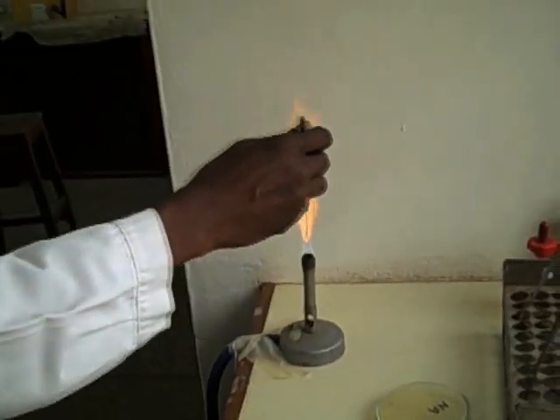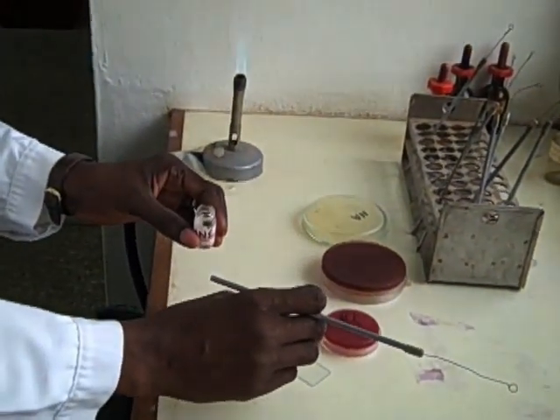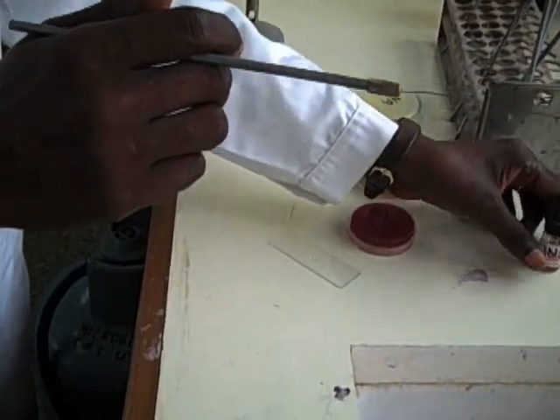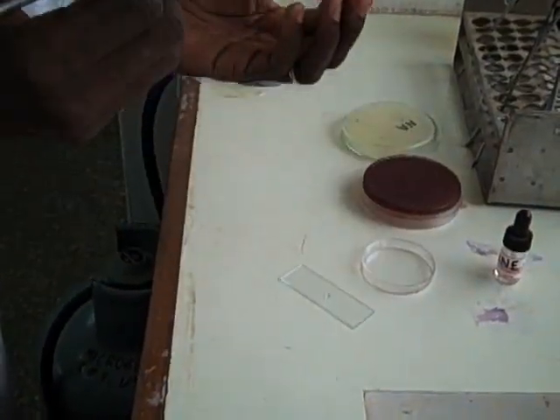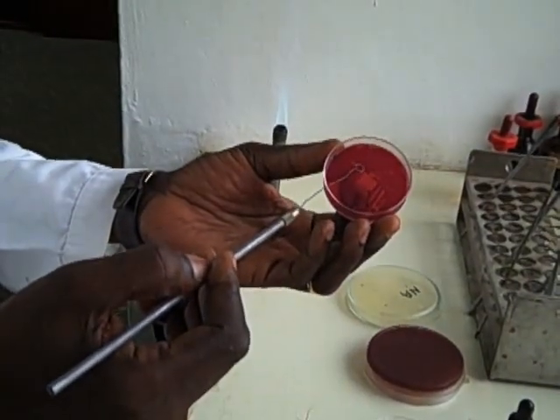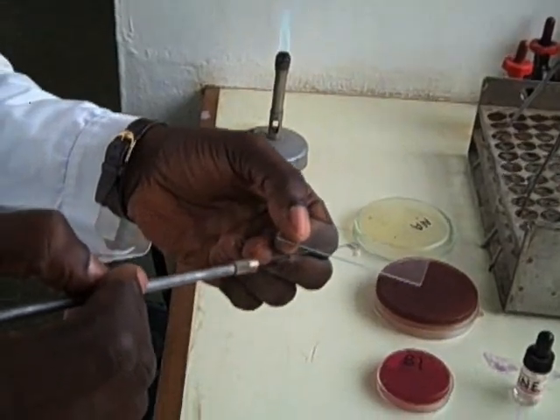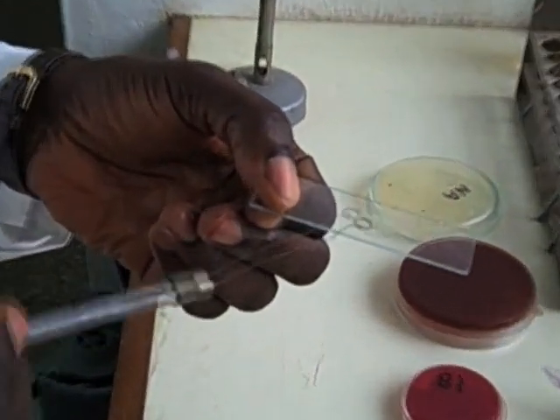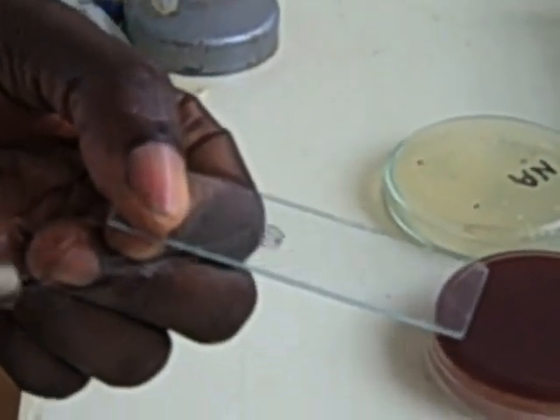Prepare this smear by flaming the loop and taking your inoculum from a fresh culture. After you put a drop of saline on a slide, take part of the inoculum from the culture, emulsify it on the slide, and join it with the rest to make a smear of about two to three centimeters.